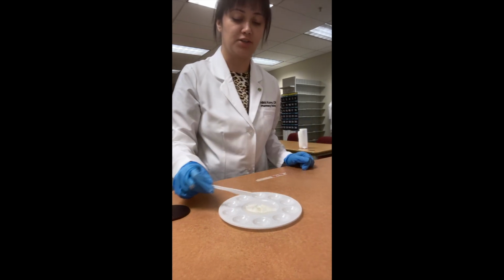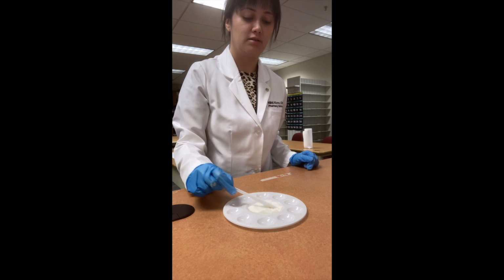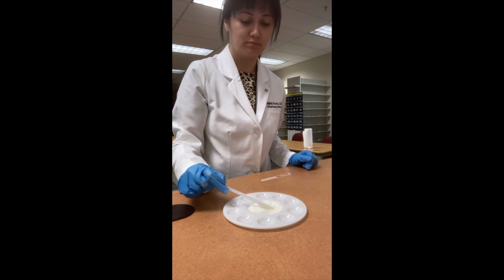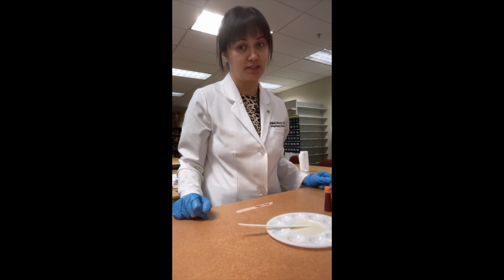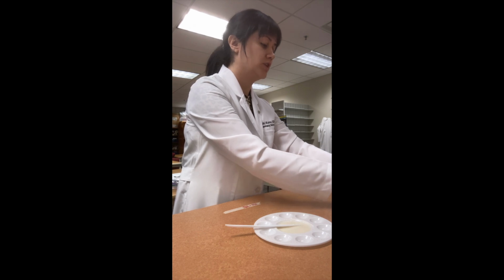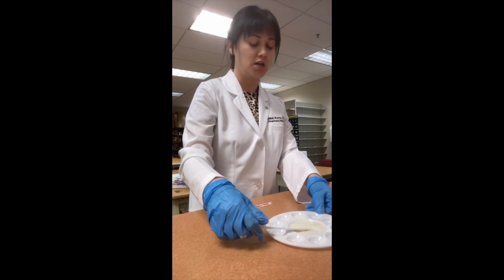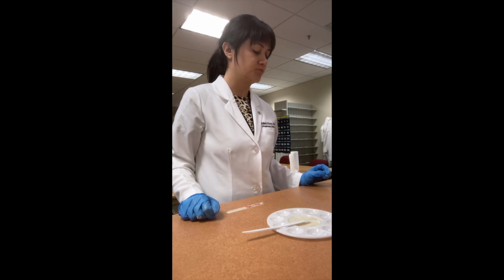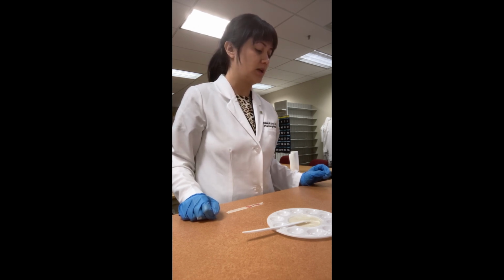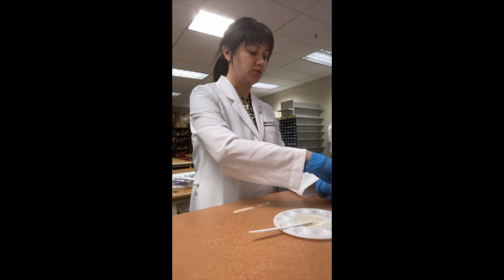Now I'm going to do the technique of spatulation, which is when you mix everything together by forming a mound and then spreading it out. So now that I've gotten a pretty decent consistency, it's time to add color. So I have different colors right here, and you should add about 2 drops. So 2 drops of the same color, 2 drops of something different, so you can mix them up. I'm going to, let's see, I want to make a peachy color. So I am going to take a drop of orange and a drop of pink.